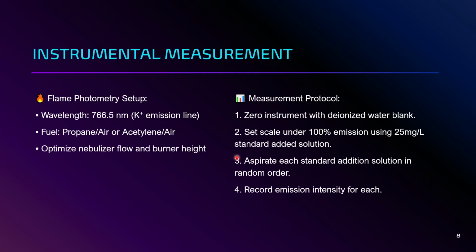So to prevent this error from happening, what you do, you take your highest concentration and set it under 100%, let's say 90% or 80%. So this guarantees that all of your solutions would always give a result, and no solution would give you any value that is going off scale, meaning beyond the 100% mark.